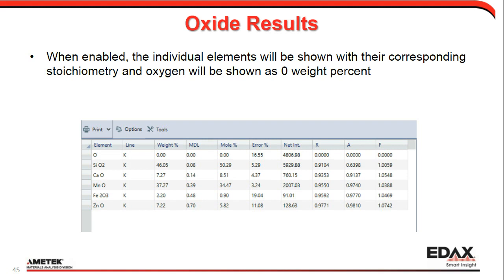There are some applications that don't want oxygen to be measured. For example, mineralogists usually don't measure oxygen directly. They would like to have the Quant results shown as oxides, with oxygen calculated based on stoichiometry. By the way, you must have oxygen identified before using oxide results.